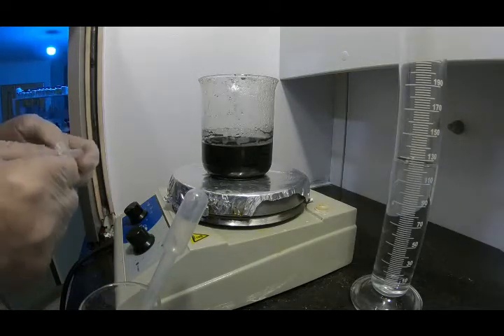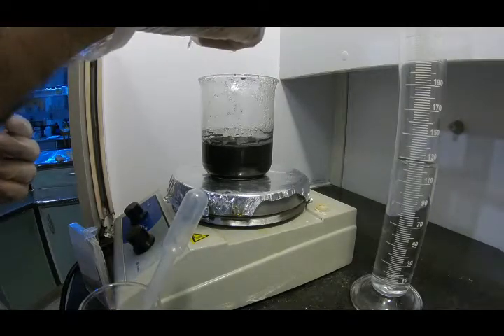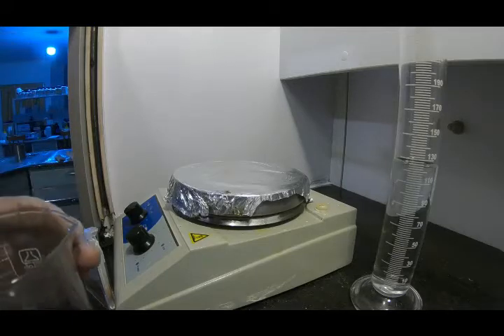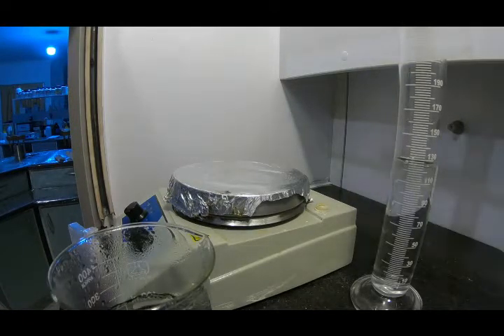Now let's check it. It is not there yet. Using these pH papers to measure the pH of the solution is not that easy, because the carbon will cover the surface of the paper. So I decided to let it settle down a little bit, then use the paper.